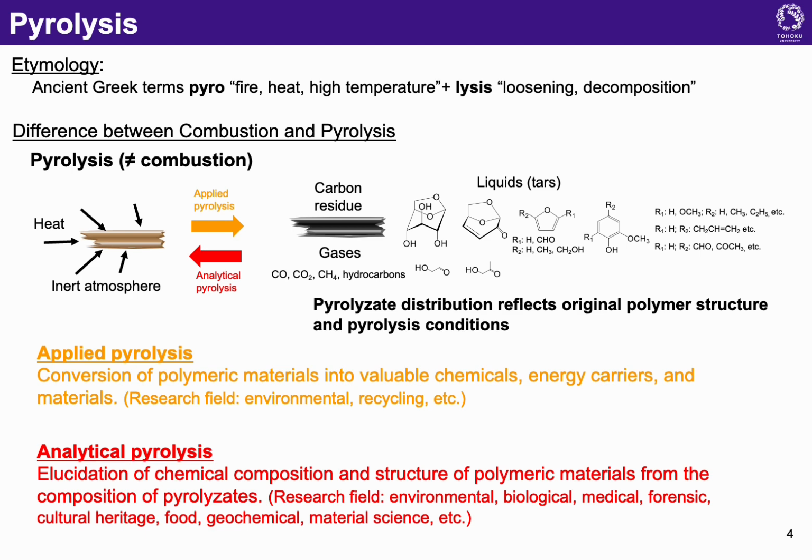Most pyrolysis research is roughly categorized into applied pyrolysis and analytical pyrolysis. Applied pyrolysis involves the development of pyrolytic processes for producing valuable chemicals, energy carriers, and materials from fossil, renewable feedstock, or waste, along with the recycling of materials and the disposal of toxic substances.